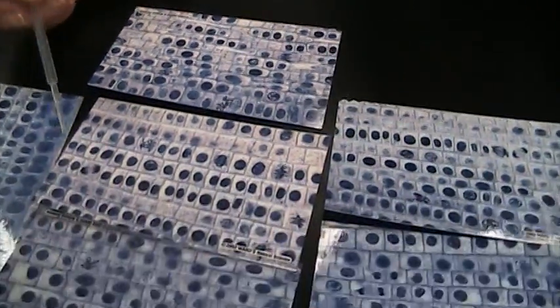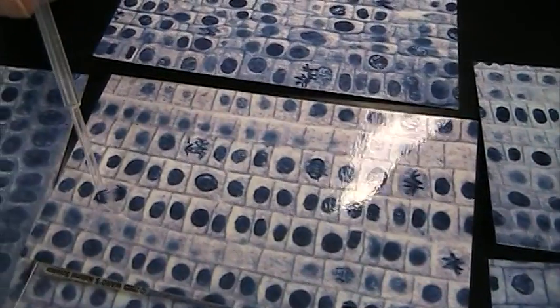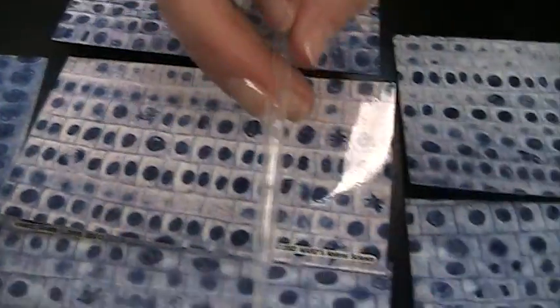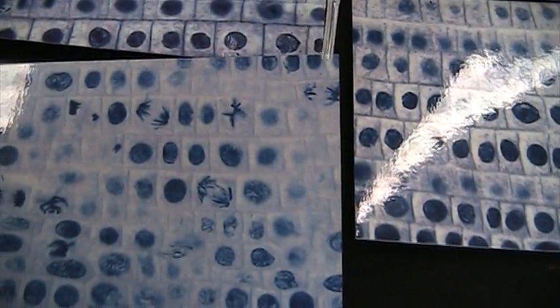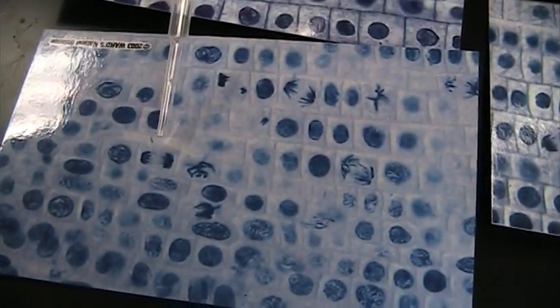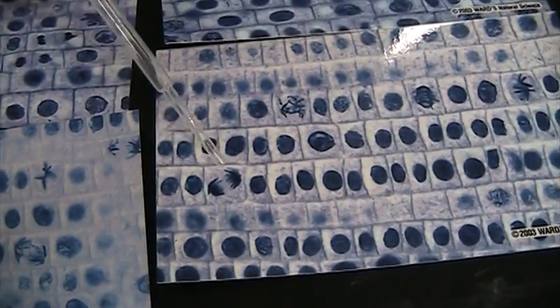Anaphase is really cool. Here's a great anaphase. You can see that those chromosomes are pulling to opposite sides of the cell. That's not an anaphase. This is a wonderful anaphase. So you can see those chromosomes being pulled apart. They used to be in the center. Here's an anaphase, this one's an anaphase, being pulled to separate sides of the cell.